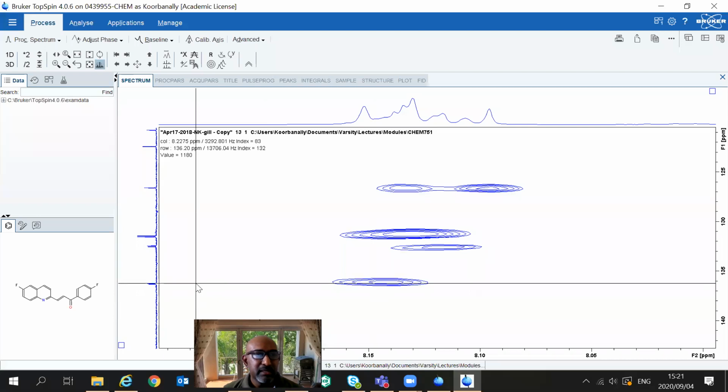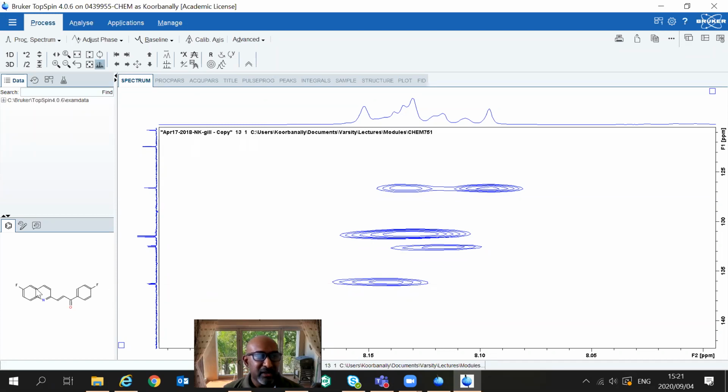All right, so you'll notice now, very intuitively, I know where to look, but I'll just tell you as well that the only other fluorine-carbon coupling in this area is going to be this proton here, because this proton is the closest to this fluorine atom. So this proton here is actually here, and I'll take you back to the proton spectrum just now and we'll re-look at this, but you see this peak and this peak, but it's a bit ambiguous here.